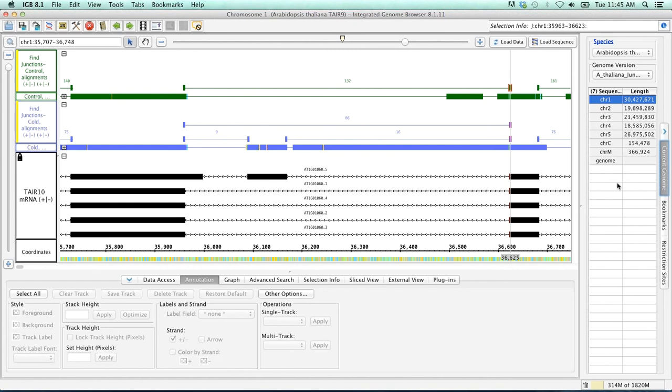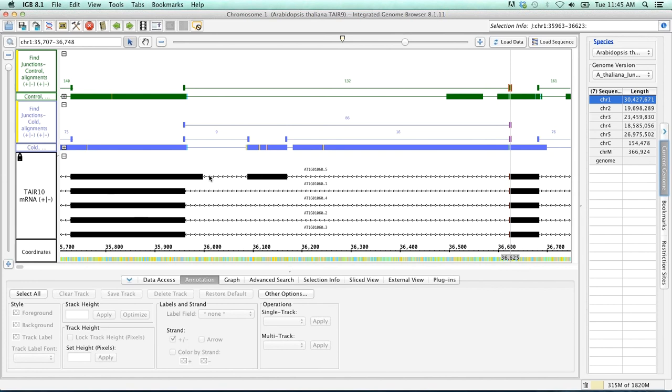So for this example, we are going to design primers within these flanking exons. The idea being that we can then look to see, just on a gel, whether or not we have this exon included or not. So if the exon is included, the gel size should be larger than if it is excluded.